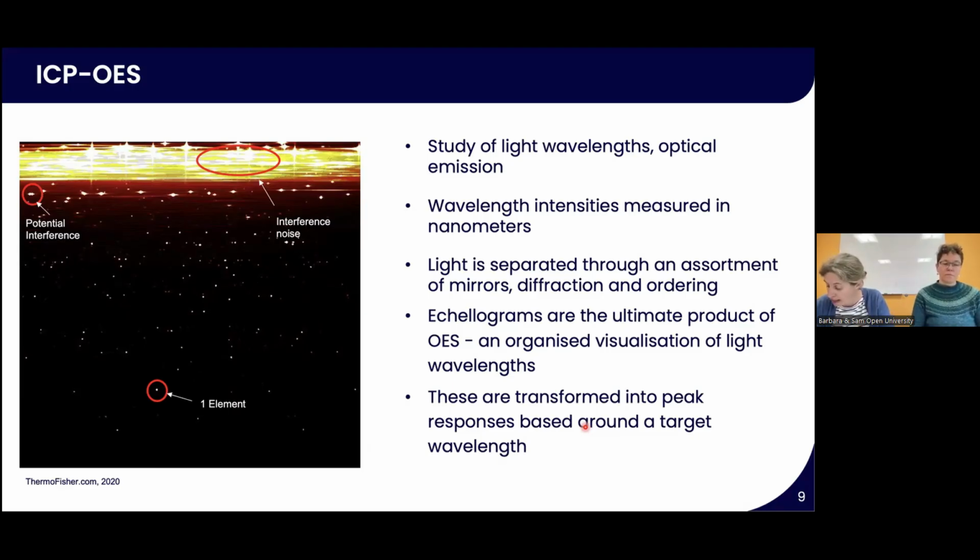So they're a bit of a workhorse, really. They also tend to be quite good at measuring those lighter masses, where mass spectrometers tend to struggle a bit because of the interferences from different gases that are introduced, either argon or oxide or nitrogen or things like that. So they have their advantages.